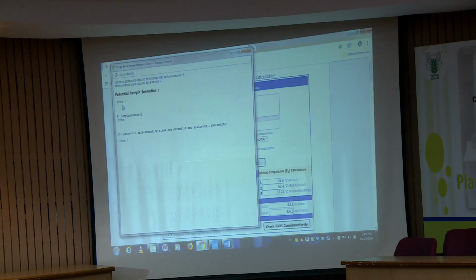So always handle such nucleotides or PCR amplicons or whatever you are handling carefully, because these are very sensitive at room temperature or at higher temperature. So always try to store it at -20. Whenever required, you just thaw it, make the required volume of, say, 10 picomole or 5 picomole, and then use it in your PCR. Okay. So, can we proceed further?